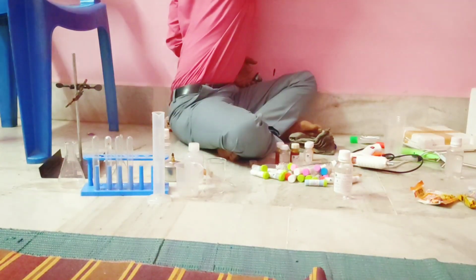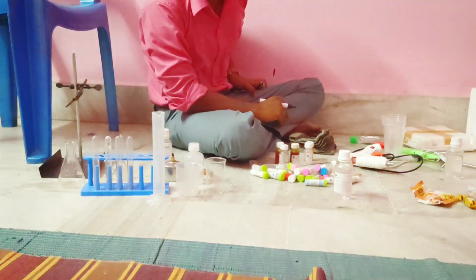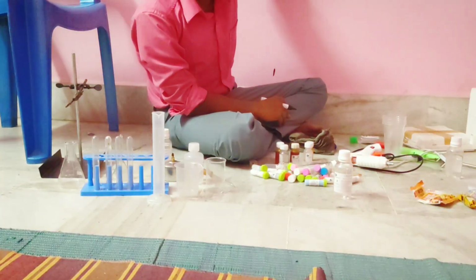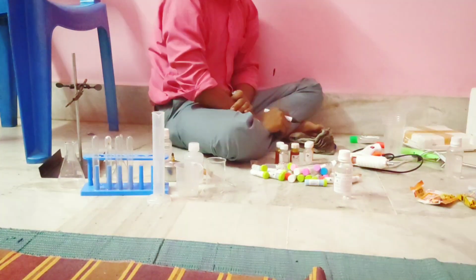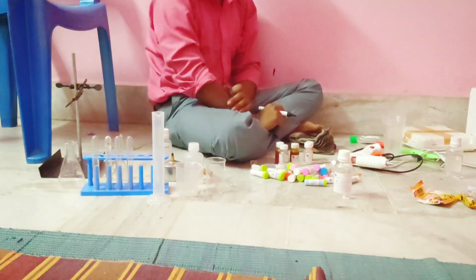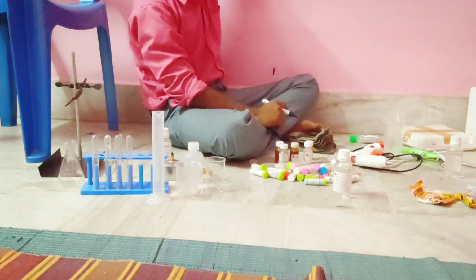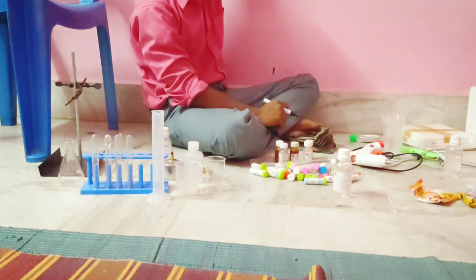Then you will notice that the salt is getting blue colored when you add salt, starch, and acid.